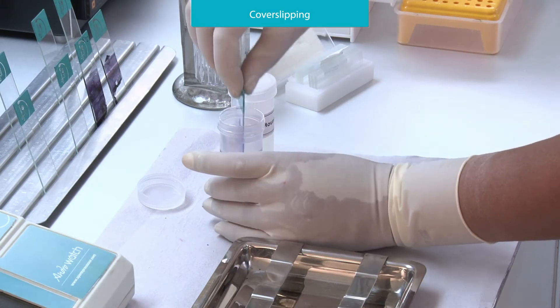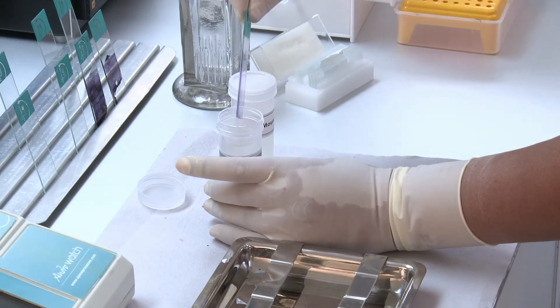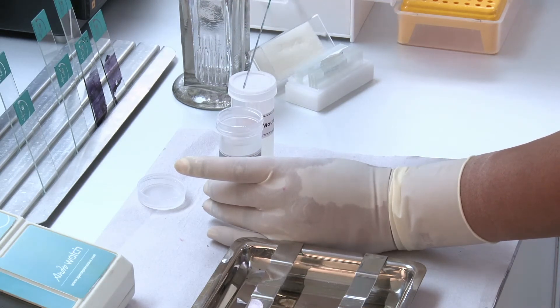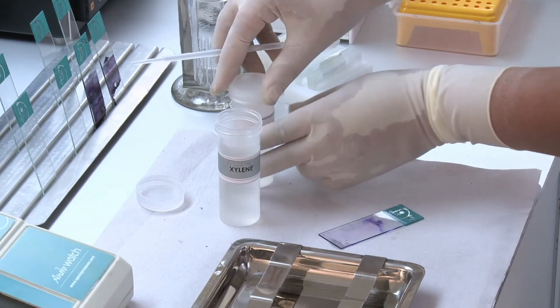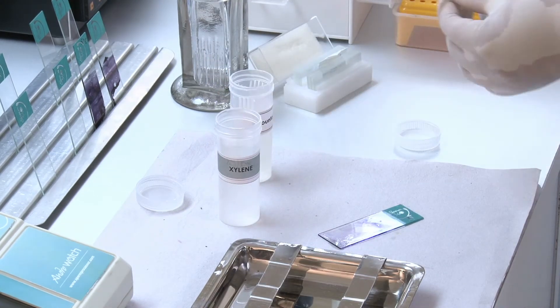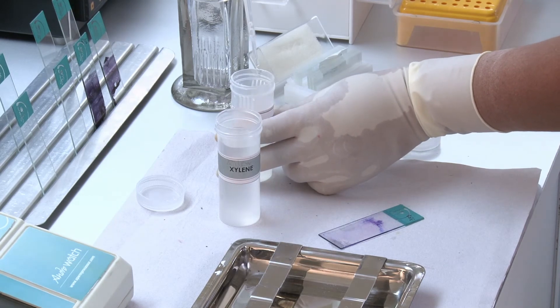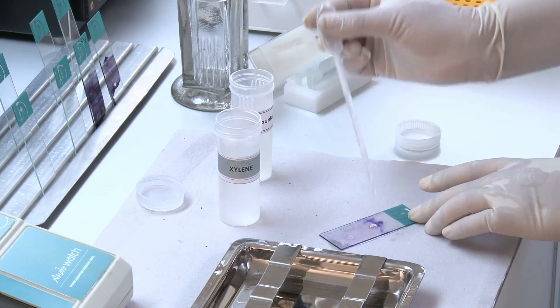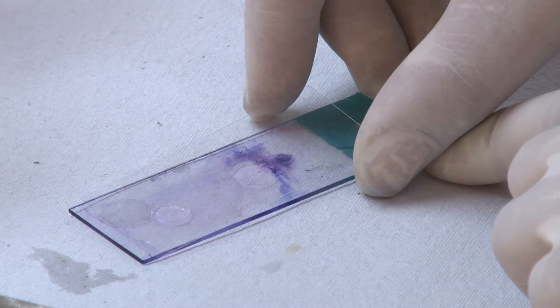Take the stained slide and dip it into xylene. Take the slide out. Place the mounting medium on the slide. Place a cover slip on the slide, avoiding air bubbles.